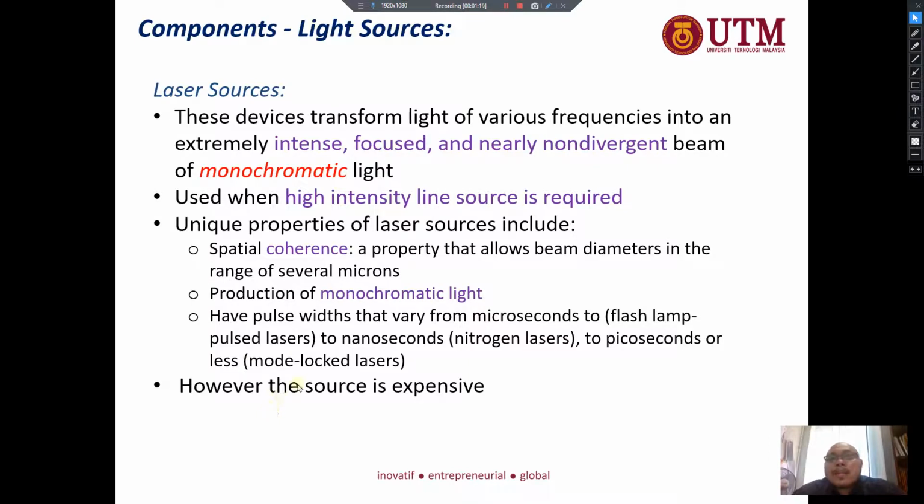An example of an analysis that uses laser, if I'm not mistaken, is Raman spectroscopy. Because for Raman spectroscopy, we need to use laser because we learned already that the amount of scattering is only about 0.0001%. The amount of interaction with the analyte is very minimal. That's why we need to use a huge intensity of source so we can read the scattering better. That is why Raman spectroscopy uses laser. For the time being, I don't remember if there is a Rayleigh spectroscopy, but for Raman spectroscopy, yes, we have it at the faculty, and actually one of my students' projects used Raman spectroscopy.